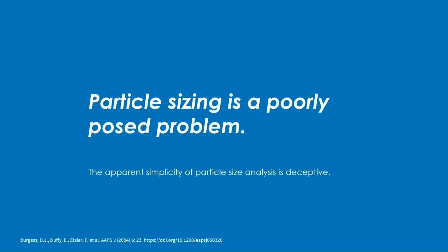If you think size measurement is simple, you may be thinking from the measurement perspective: putting the sample into an instrument and getting a readout very quickly in a few seconds. So the simplicity of actually measuring particle size is very deceptive. The difficulty, the problem, is actually why we measure particle size and what we are actually measuring. Over the years, I've generated my own thinking around this statement, that particle sizing is a poorly posed problem. So I further define this in two aspects that I'm going to share with you next.